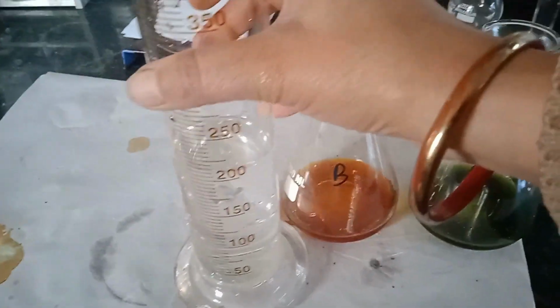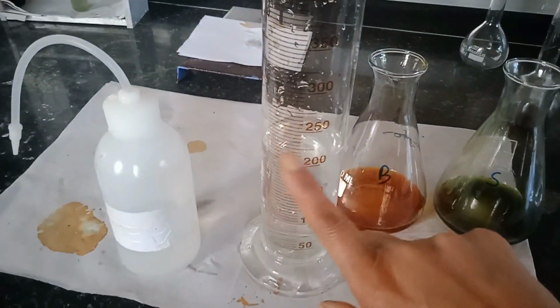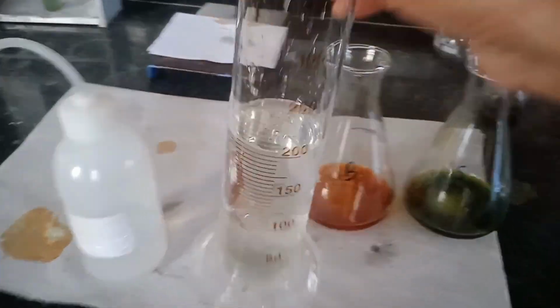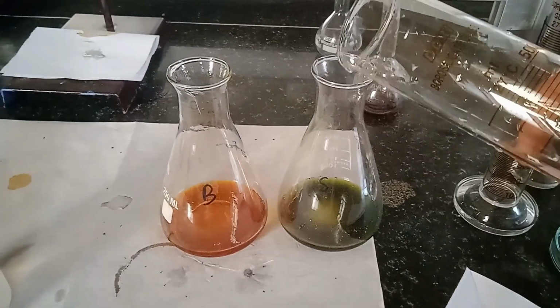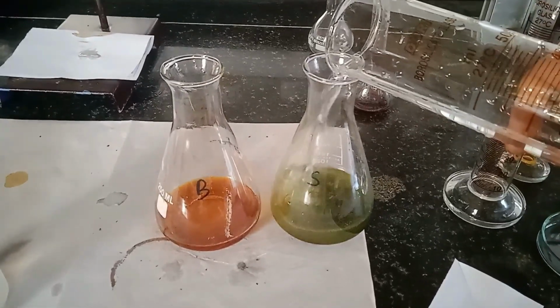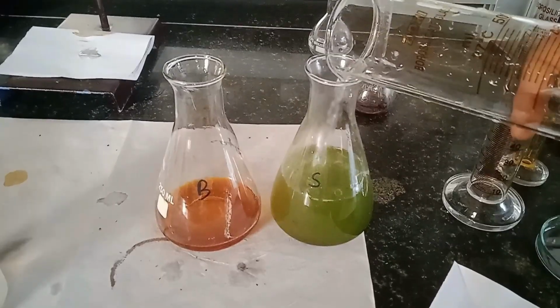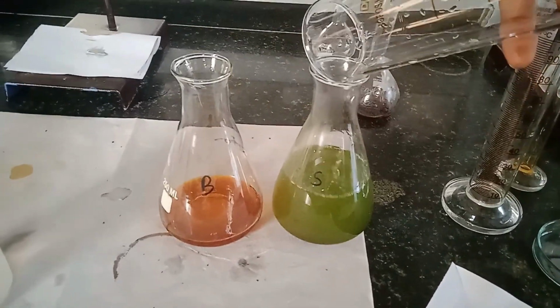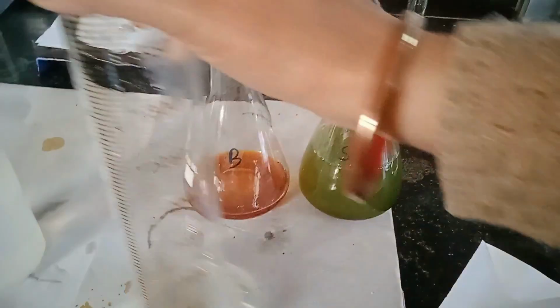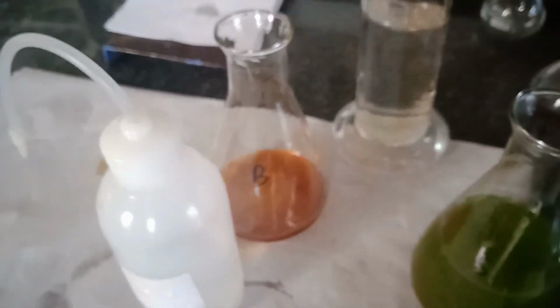To this we are going to add 200 ml of distilled water. Here I am going to add 200 ml of distilled water to the sample, and 200 ml of distilled water I am going to add to the blank, so you can see the color. Now we are going to add 200 ml distilled water to the blank.